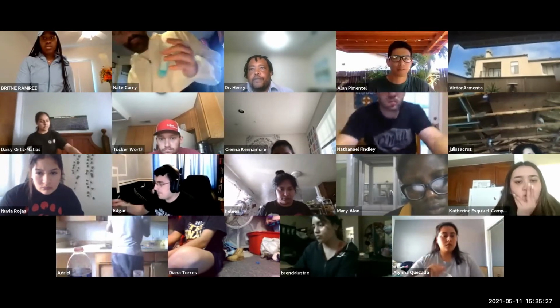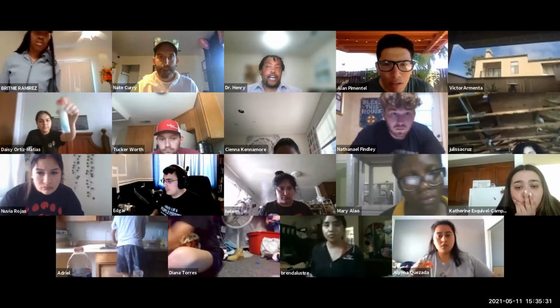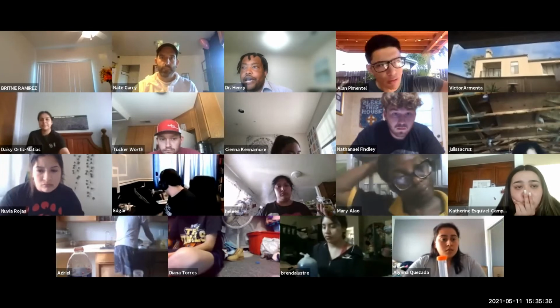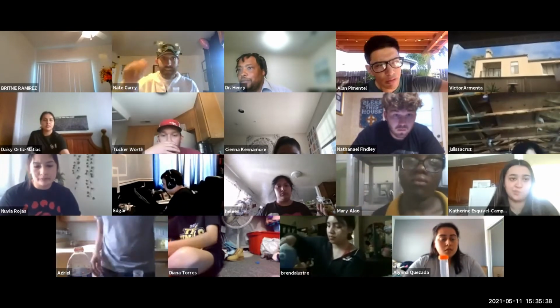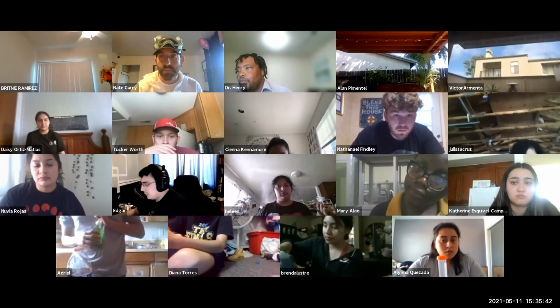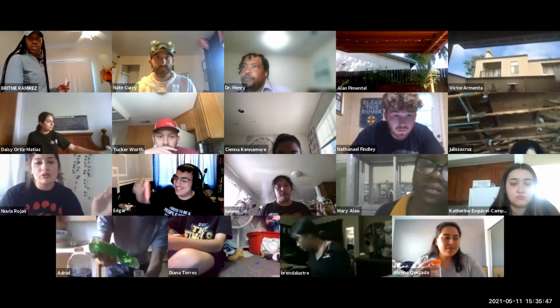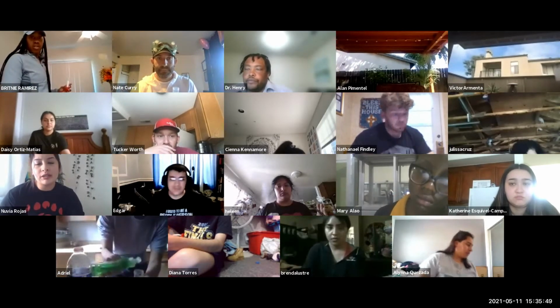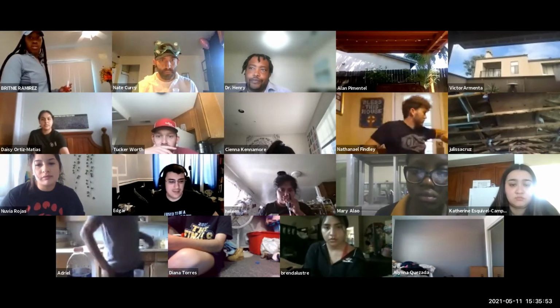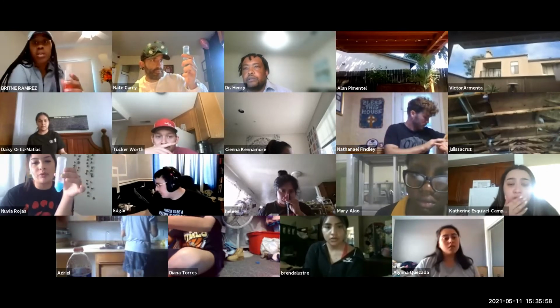Okay then. Do me a favor, everybody: I want you guys to refresh because I'm modifying as you go. Like I said, it was set up differently for the other class. Hey, don't pour the baking soda in your tube directly over your computer because it'll bubble up. So where do we add the dish soap? You add it to the conical tube.